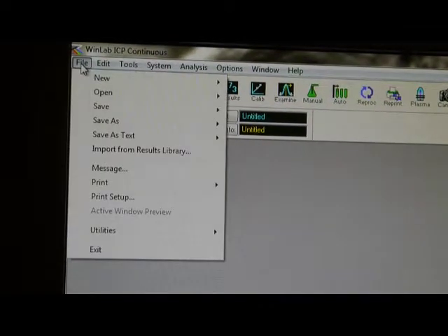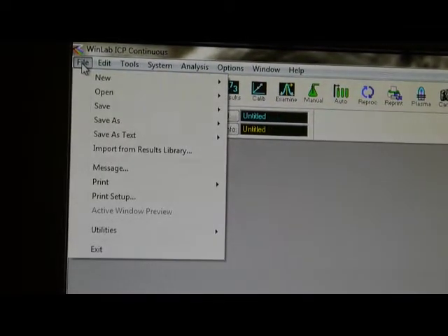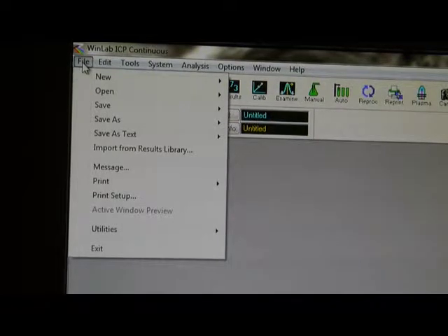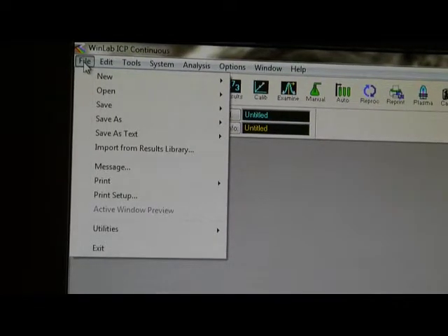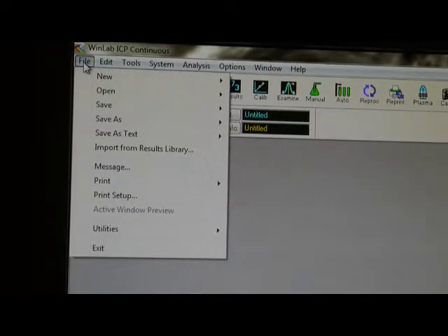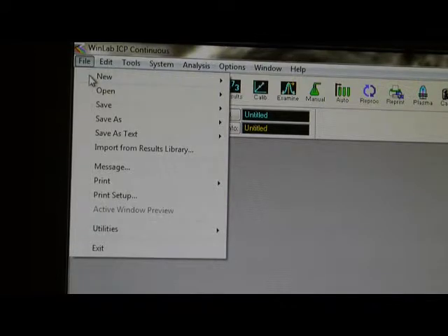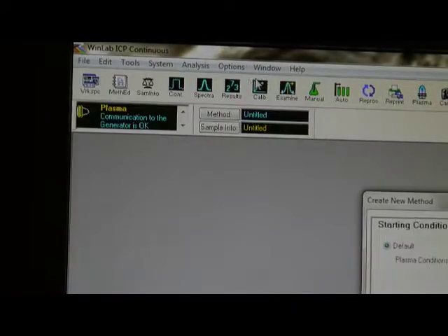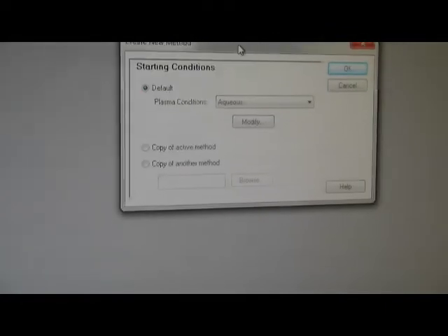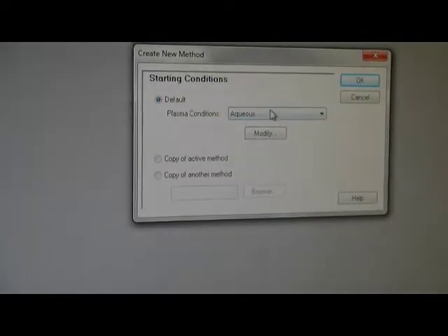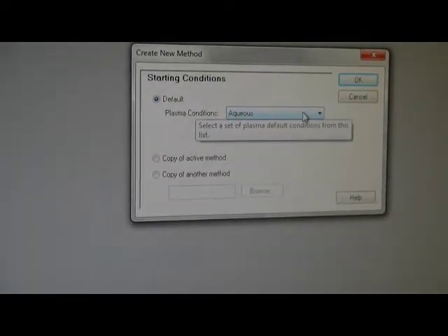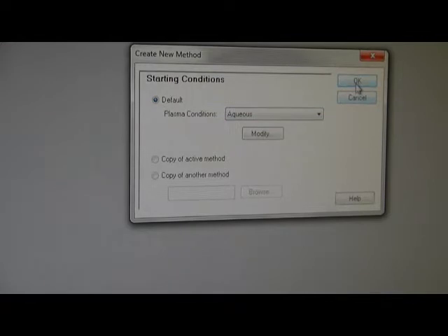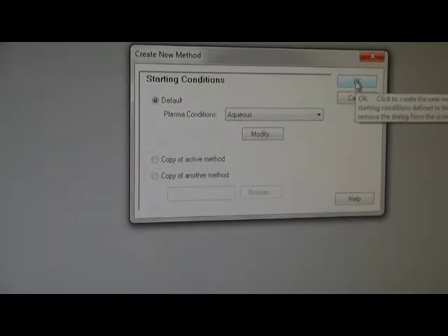For the first time, you need to create your own methods. The steps are: File, New Method. For this one, always choose aqueous and you click OK.